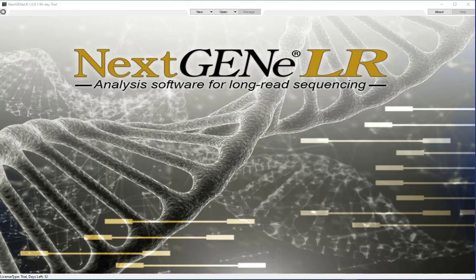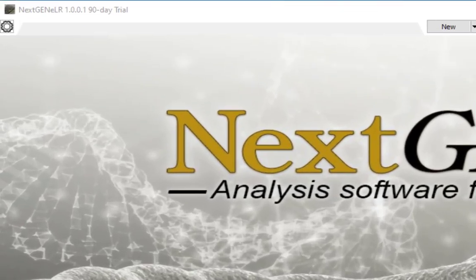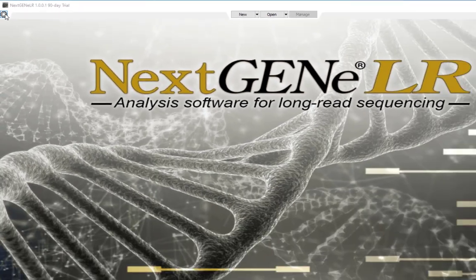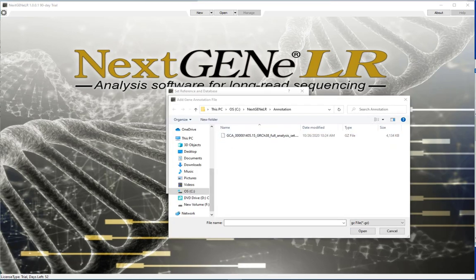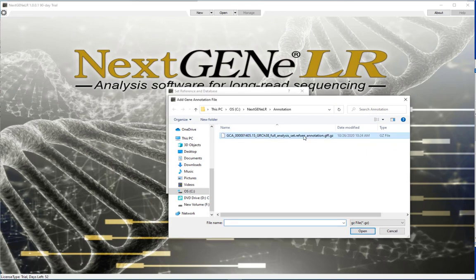There are a few settings to review before beginning analysis with NextGene Elahar. Click the settings icon. The first setting is to define the path for the gene annotation GFF file. This will provide the annotation shown in NextGene Elahar. A link to download the required gene annotation files is provided along with the NextGene Elahar software installation file. If you haven't already downloaded, you should do so before moving forward. The files can be saved to any location on your computer.